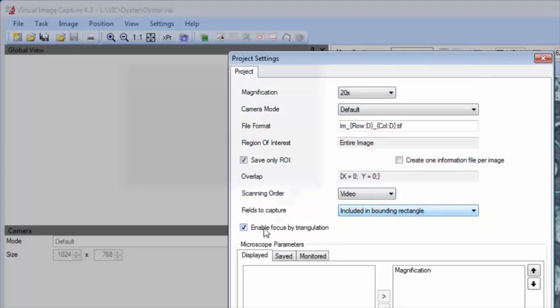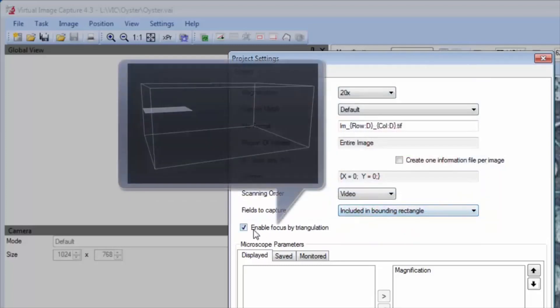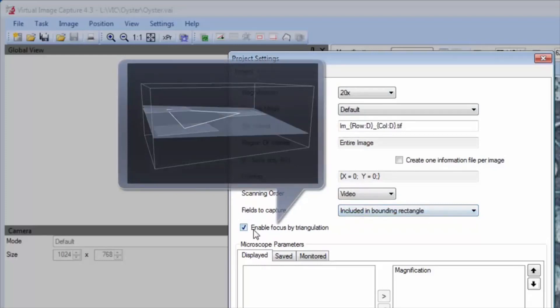The focus by triangulation allows the user to manually define focus locations. It then sets the focus for each image based on the best fit plane to the defined focus points.